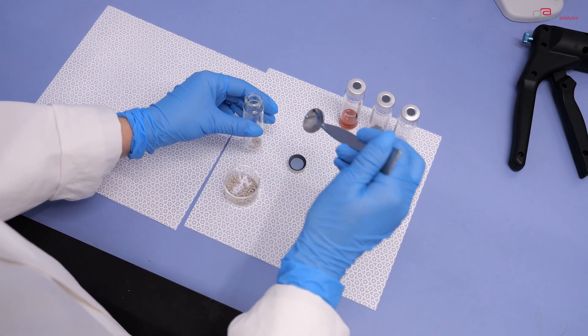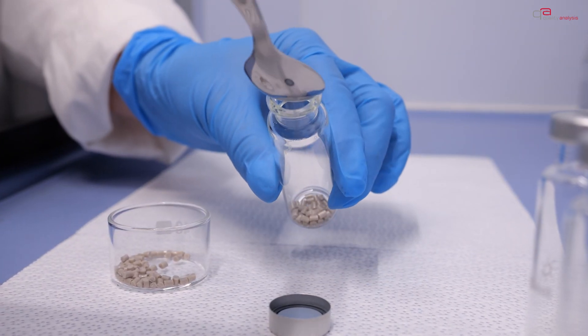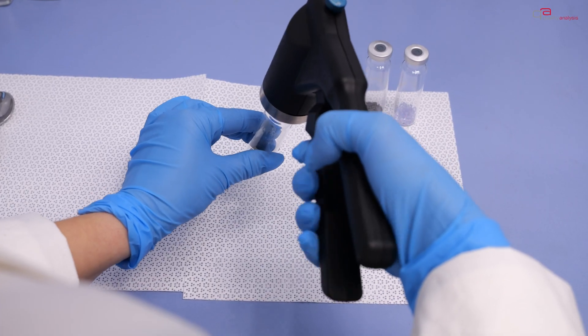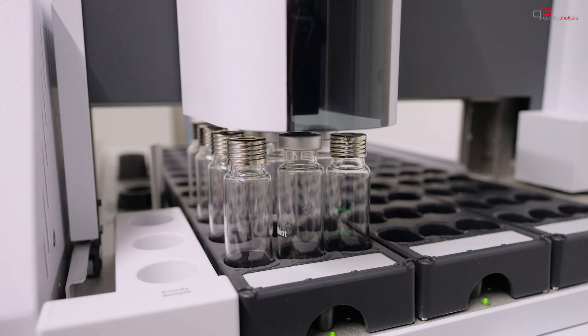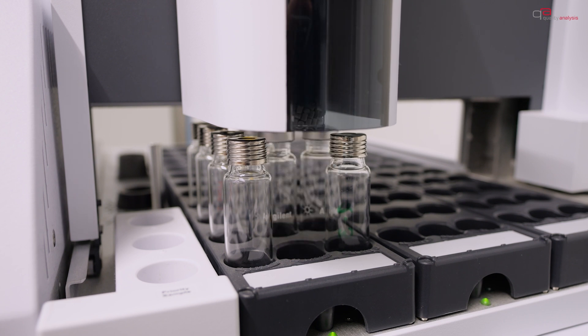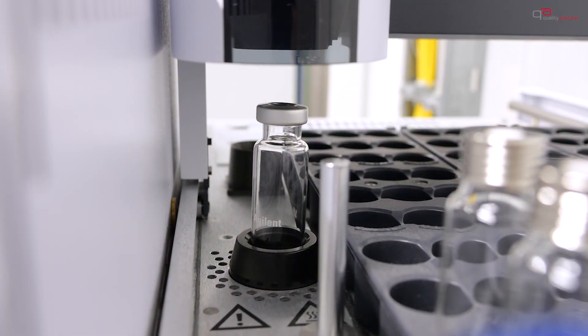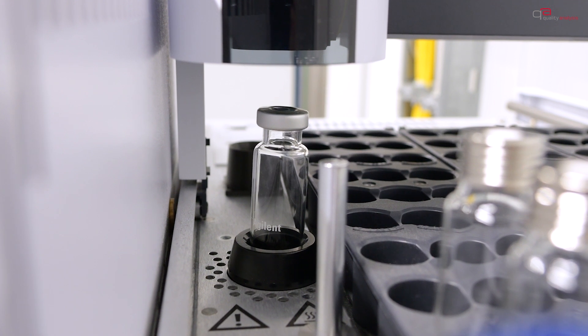First, the sample is placed in a gas-tight headspace vial and tightly sealed. The vessel is then heated until the volatile compounds pass into the gas phase. A volume of gas is extracted with a needle and injected into the GC.